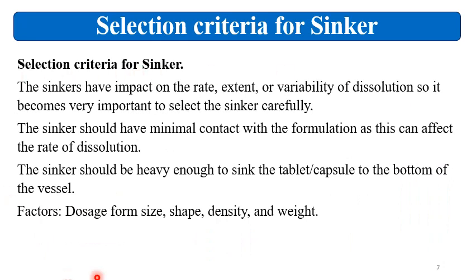Then selection criteria for the sinkers. What is the selection criteria? The sinkers have an impact on the rate and extent of dissolution. Also, they impact the variability of the dissolution. So it becomes very important to select sinkers very critically and carefully. See, the sinker should have minimal contact with the formulation, as this can affect the rate of dissolution. If your formulation has much contact with the sinker, then variation will be there.